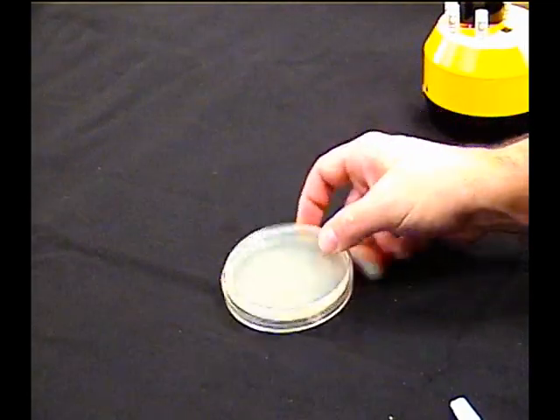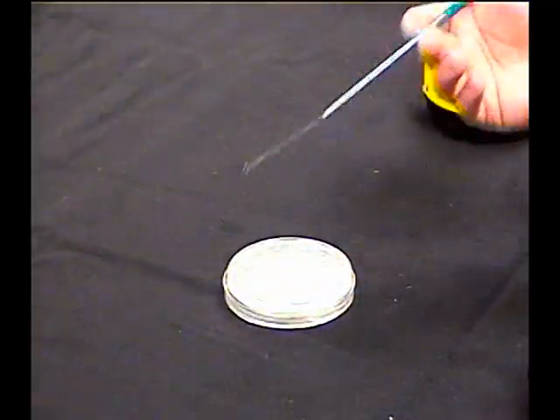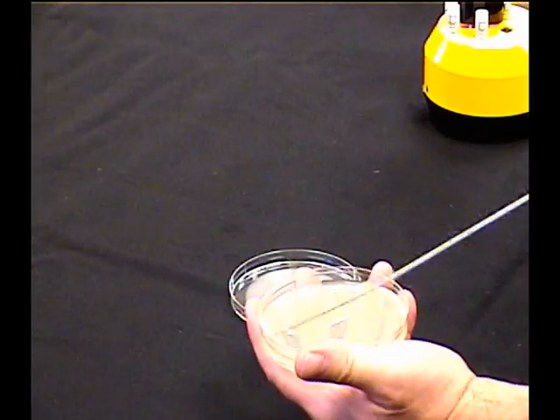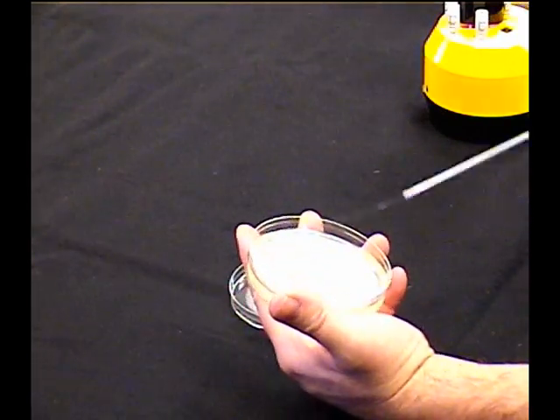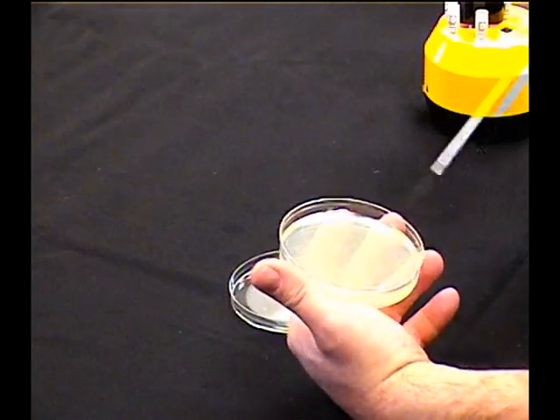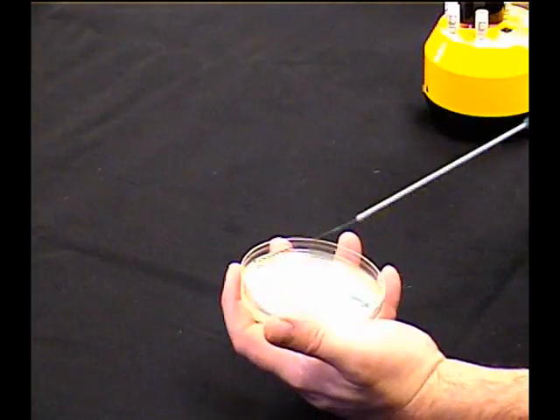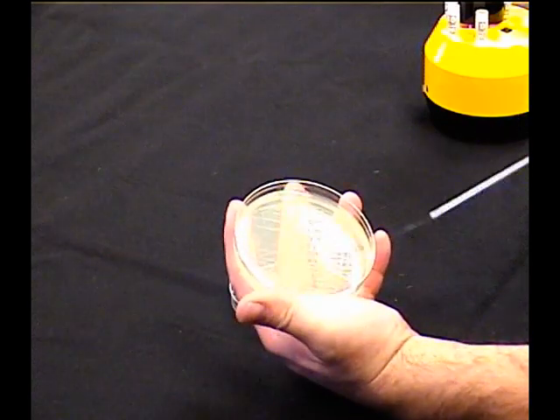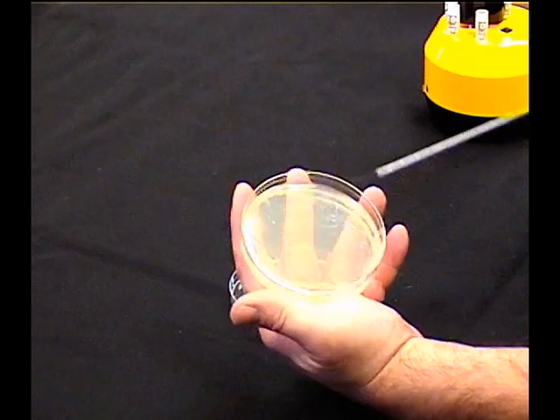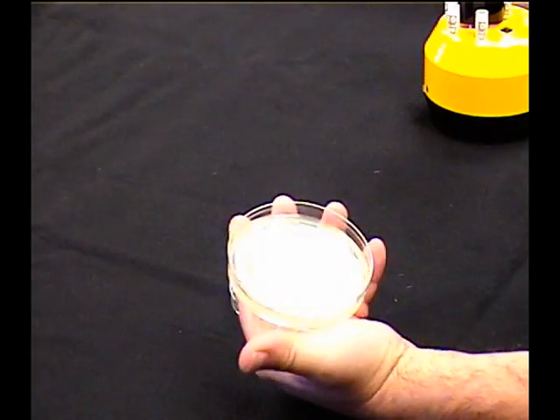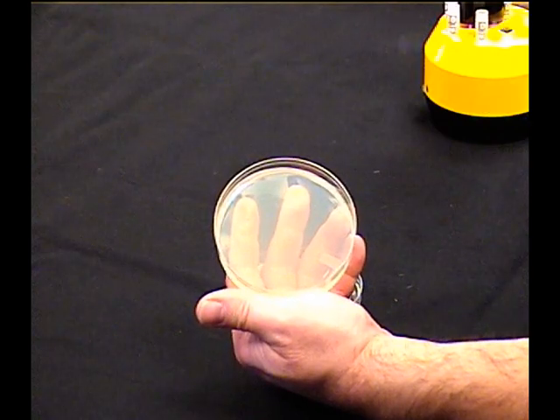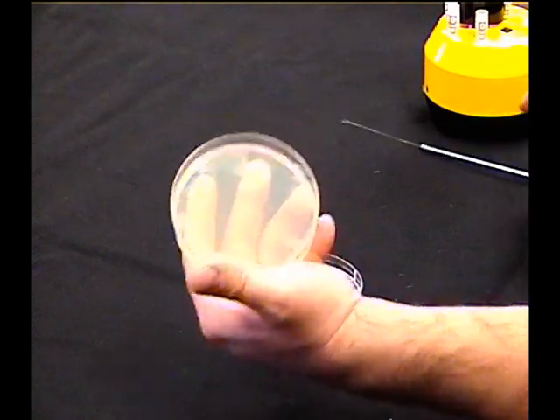You're going to take a plate, take an organism, flame your loop, cool your loop, and spread the organism over the entire surface of the plate. Just keep going until you've covered the plate completely. You'll notice that I've turned this multiple times to keep going back and forth. Don't talk on the plate while you're doing it. Then flame your loop, cool your loop. That part's done.